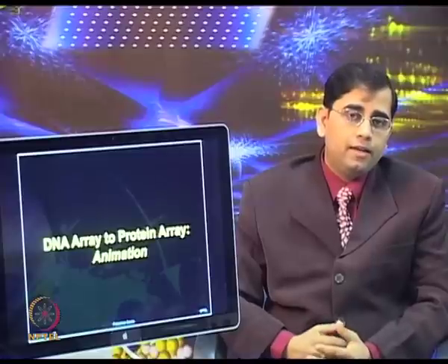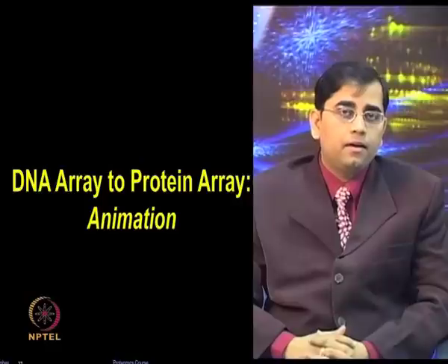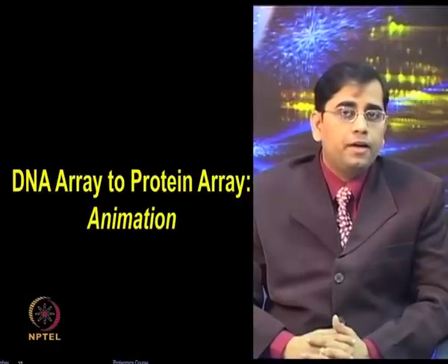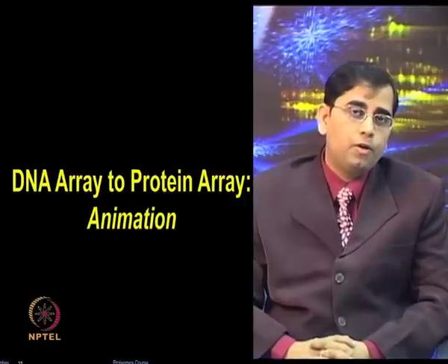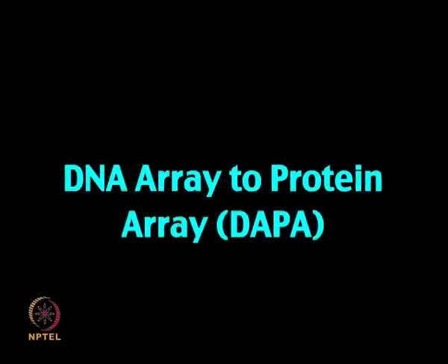By using DAPA, it is possible to use the same DNA template repeatedly to print multiple protein arrays, and it has been shown that one can use this template for printing almost 20 arrays. So, let me show you the working principle of DNA array to protein array, known as DAPA, in this animation.